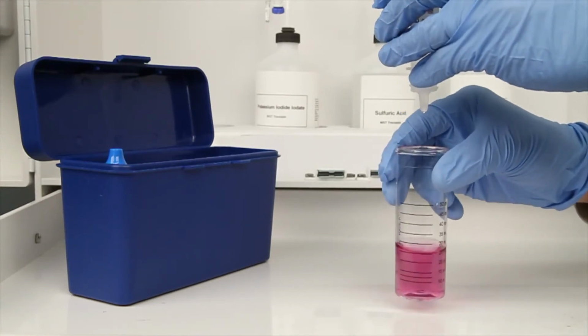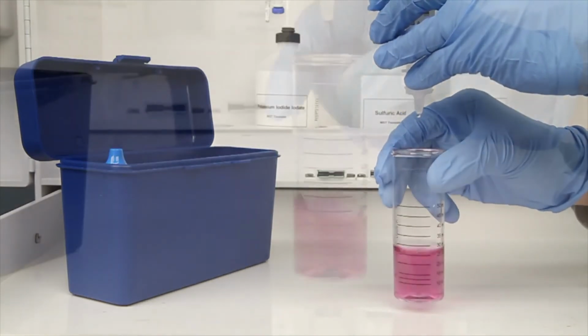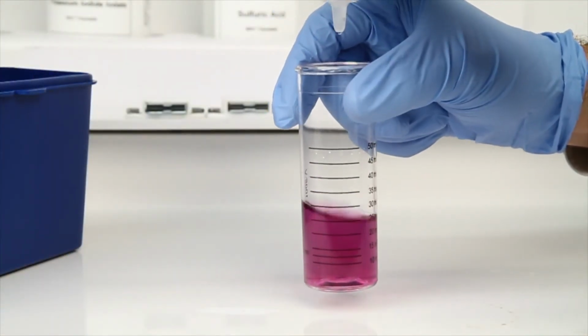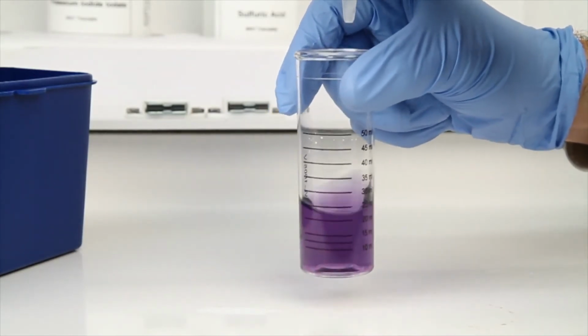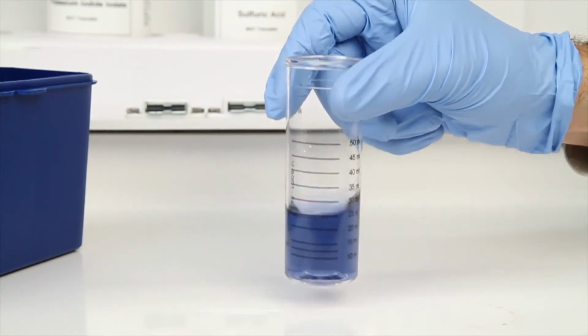Be sure to hold the bottle vertically to get a consistent drop size. After the addition of each drop of titrant, you want to swirl the vial to make sure the sample is properly mixed. According to the endpoint ID procedure, the titration is complete when the sample has changed from red to blue.